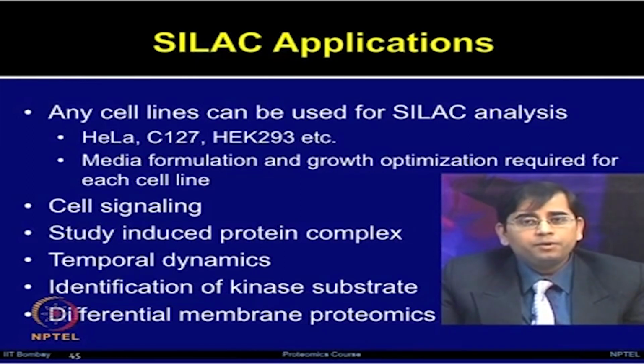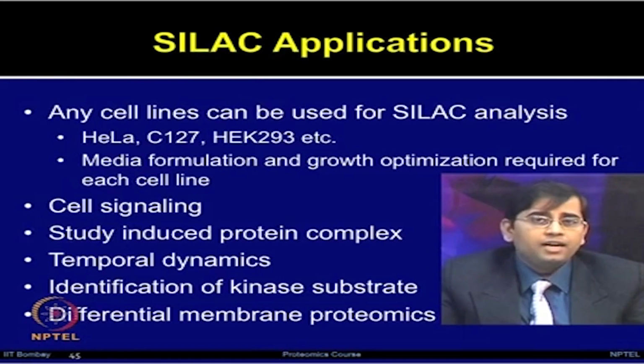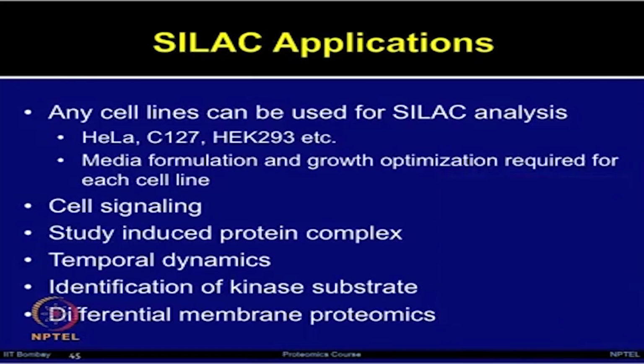SILAC applications have been demonstrated in different areas such as cell signaling, studying induced protein complexes, studying temporal dynamics, identification of kinase substrates, studying differential membrane proteomics. So, there are various applications. We will have a look at some applications now.